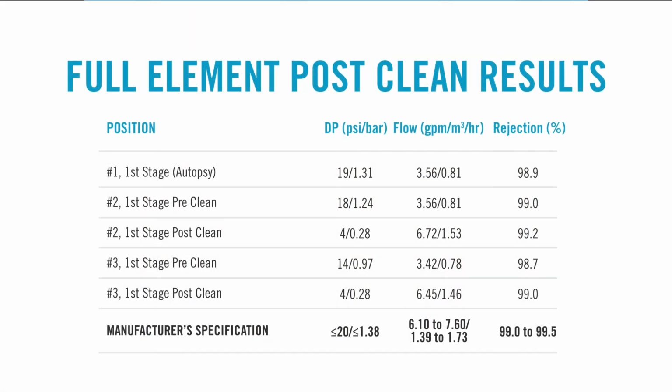The site provided us with 3 elements. We chose 1 for autopsy, and we reserved the remaining 2 for full element cleaning. This gives us an opportunity to trial our product that we've chosen on a full element.